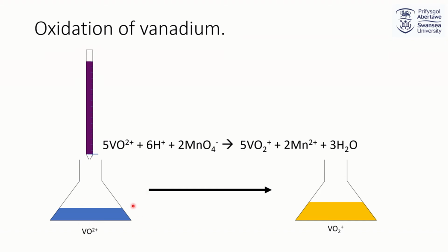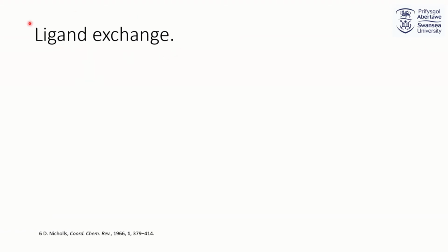When any new colour is observed, let's say a clear, stable colour such as the blue or the yellow, again measure the peak absorbance wavelength. There should be a green transition colour, as it's just the inverse of the first step in the reduction. Now I'll cover a couple of ligand exchange reactions.